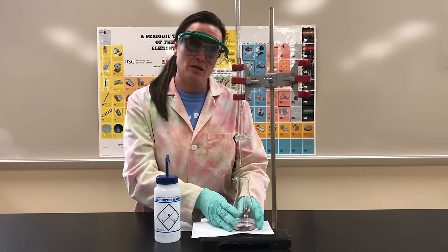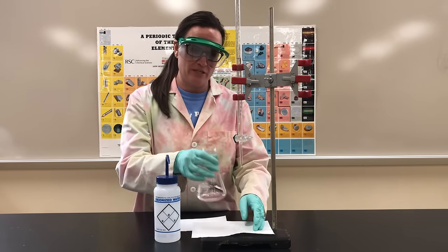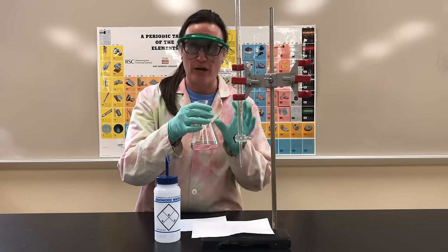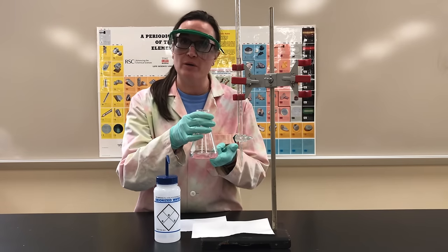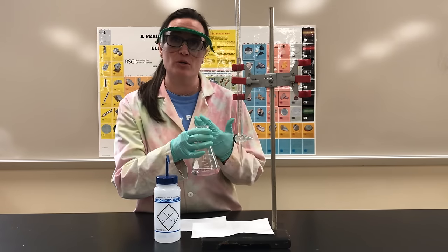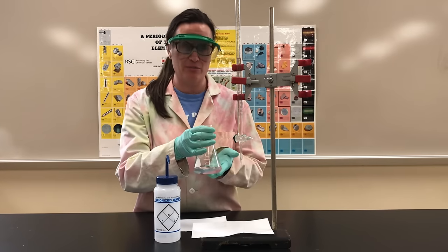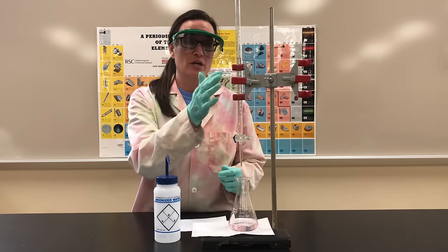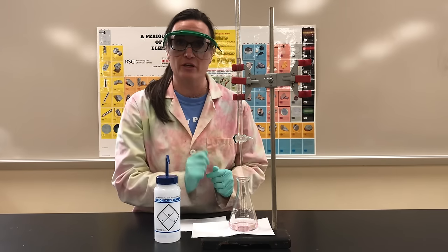Once that pink color persists for 10 seconds or more, your titration is over. You can see that my bright pink actually turned into a light pink upon standing. That's typical. Within 30 seconds to a minute, a lot of times it'll dim. This is a great endpoint for this titration between vinegar, sodium hydroxide, using phenolphthalein as the indicator.